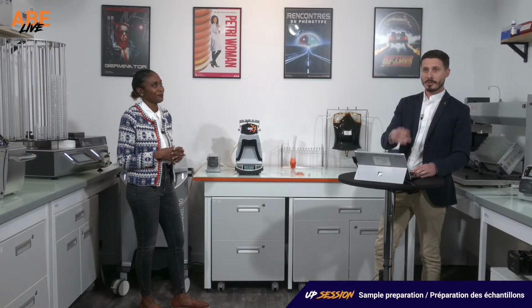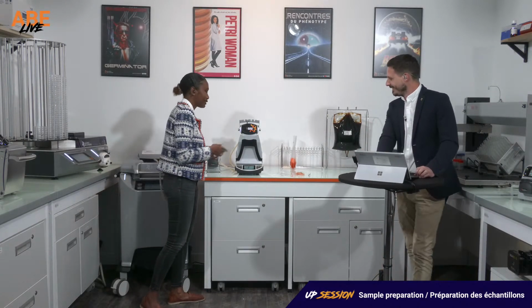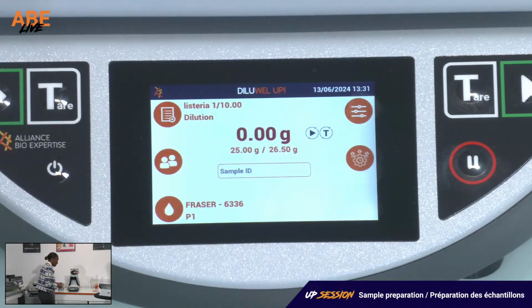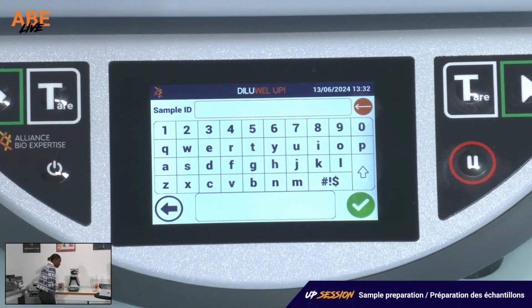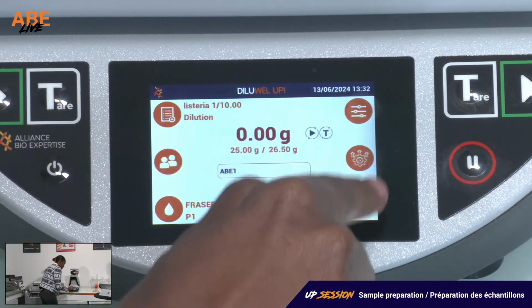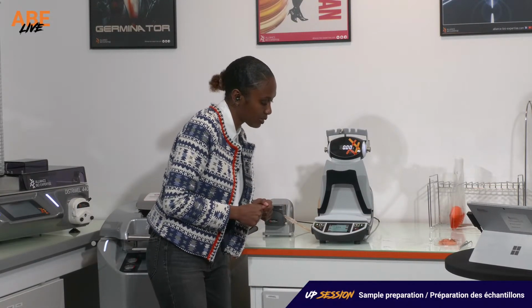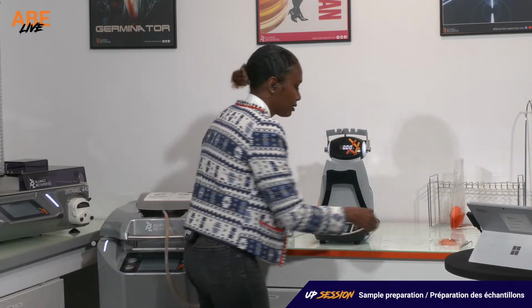Okay. I don't know about you, but I really want to see it in real. Yeah, okay. So it's good because we have a salmon to dilute. Yeah. So I will activate auto tare and auto start and the incrementation. And for this sample, I will give it a sample ID. Let's call it ABE1 and validate. So here I have my sample ID. I can see with these little icons that I have my auto start activated and my auto tare activated. So I can begin my dilution.